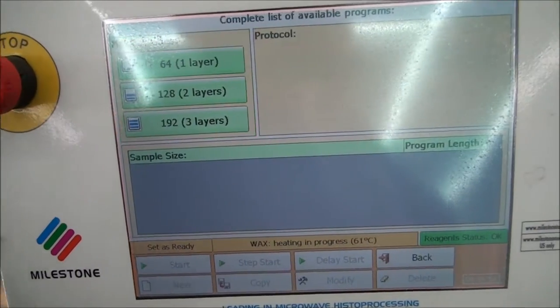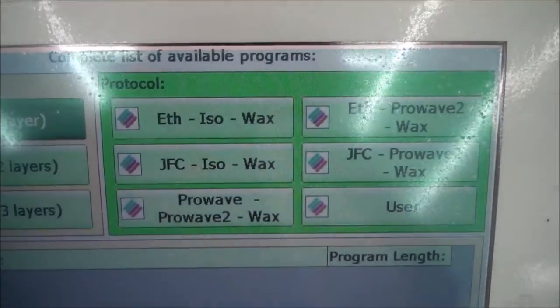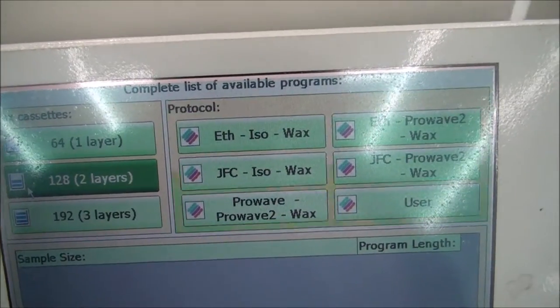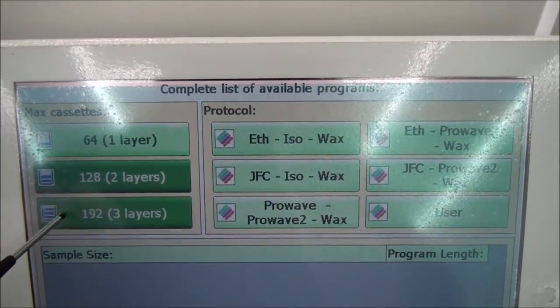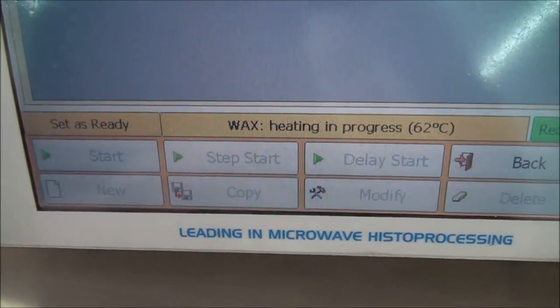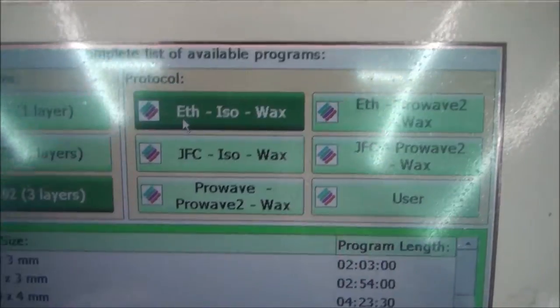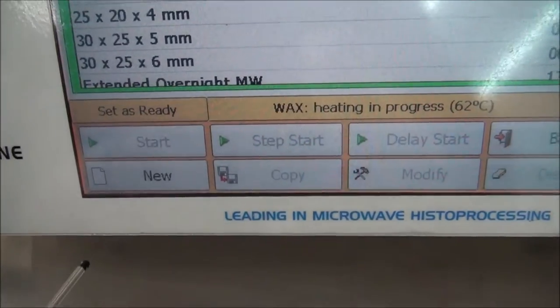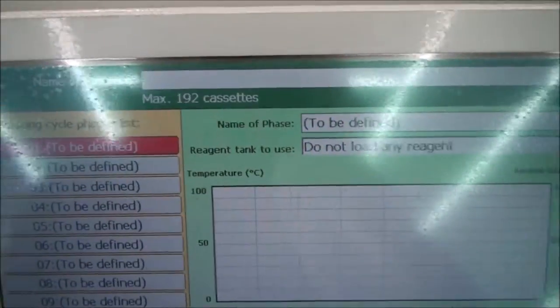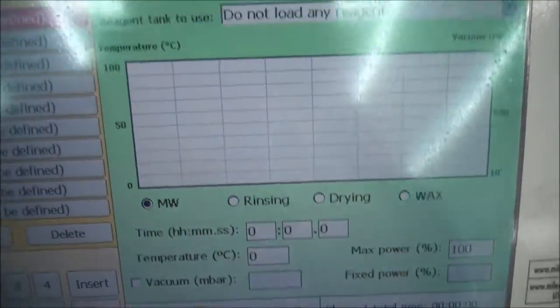This screen displays all available histoprocessing protocols. You may select how many rack layers you wish to process, with each layer able to hold 64 samples. After you have selected the number of layers, select the correct protocol. After selecting a protocol, you will see a list of all available standard and custom programs for the selected protocol. You may also create a custom protocol by touching the New button at the bottom of the screen, which opens a window that allows you to adjust all of the parameters and steps of your custom protocol.